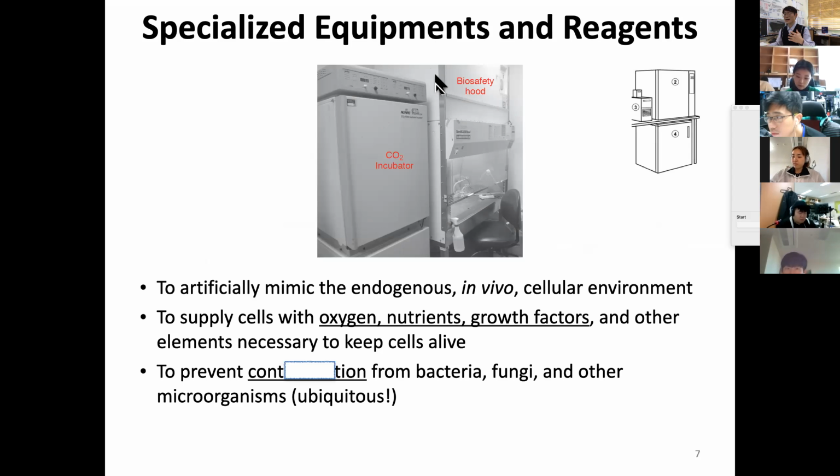Inside there is a HEPA filter, which filters any kind of bacterium or microorganisms. And then the air should come from in to out, because there are microorganisms everywhere, even in the air too.